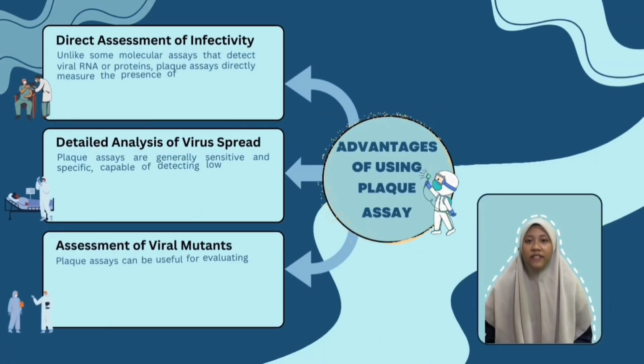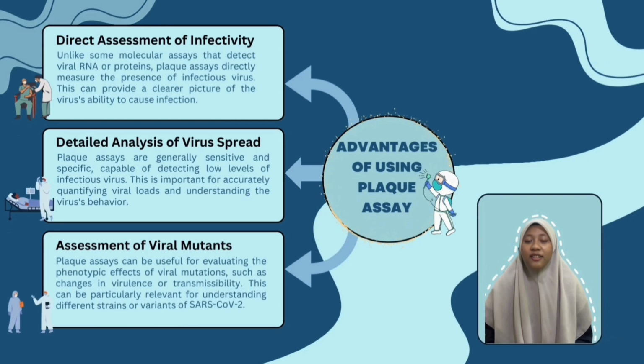Next, we move on to the advantages of plaque assay. Firstly, plaque assay gives a direct assessment of infectivity. Unlike some molecular assays that detect viral RNA, plaque assay directly measures the presence of infectious virus, which can provide a clearer picture of the virus's ability to cause infection.